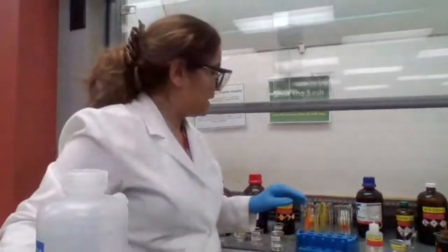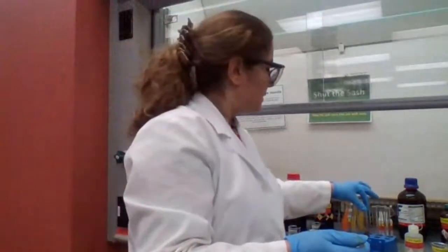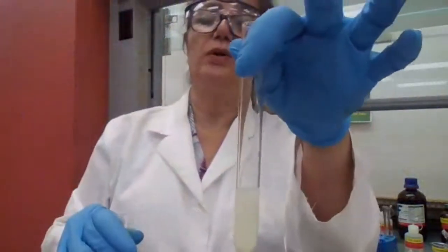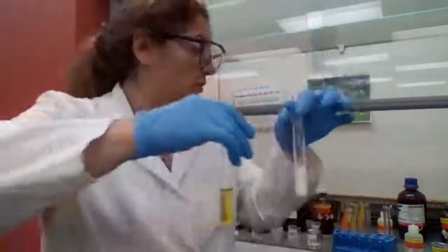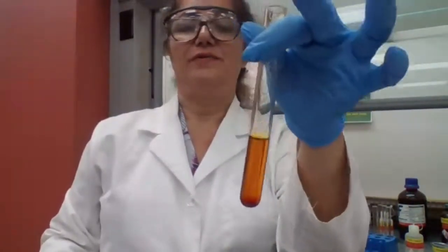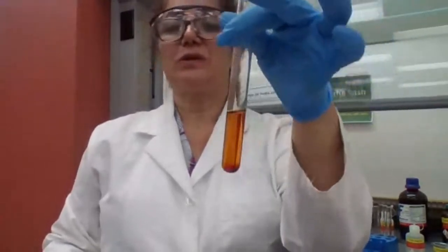Okay, the positive test actually was for acetone. Acetone was positive, cyclohexanone was negative. Cyclohexanone and acetone. Acetophenone did not form precipitate. I'm going to leave it and wait for 15 minutes because this wasn't giving me precipitate, and I wanted to show you how the positive test looks like.